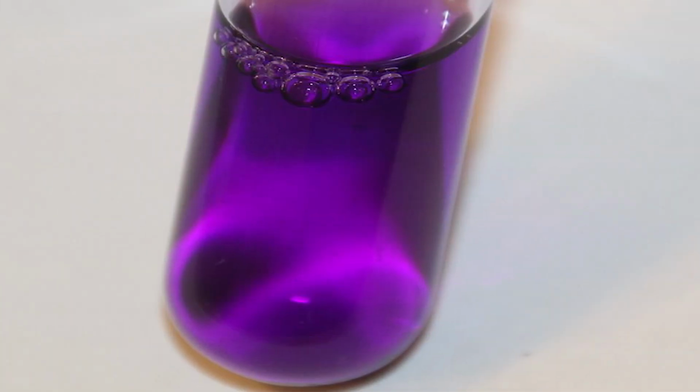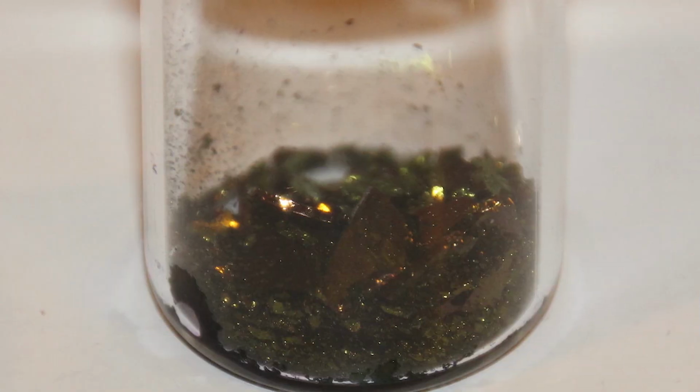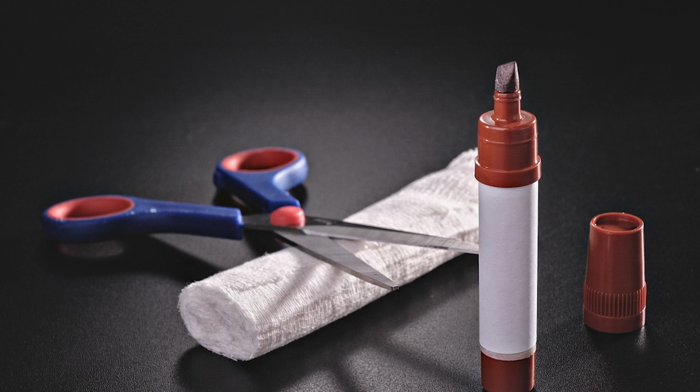Crystal violet. Crystal violet, or gentian violet, also known as methyl violet, is a triarylmethane dye used in histological staining methods and the gram stain for classifying bacteria. Crystal violet has antibacterial, antifungal, anthelminthic, antitrypanosomal, and anti-tumor properties. Crystal violet was formerly an important topical antiseptic.